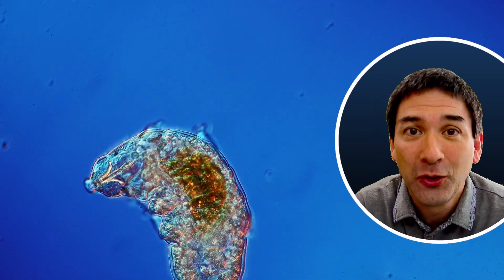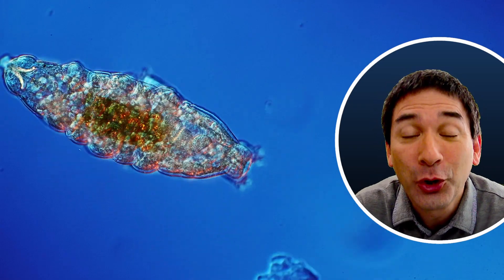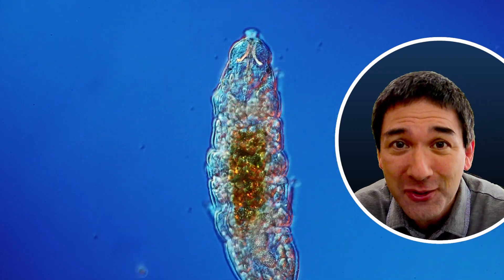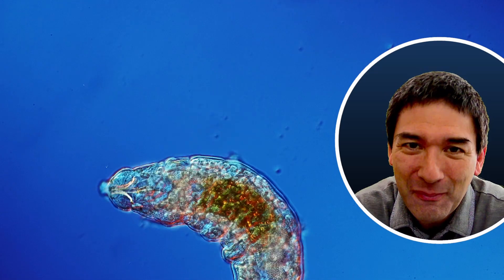This here is a water bear, also known as a moss piglet or tardigrade, and today in this video I would like to show you where you can find them so that you can also observe them under the microscope.